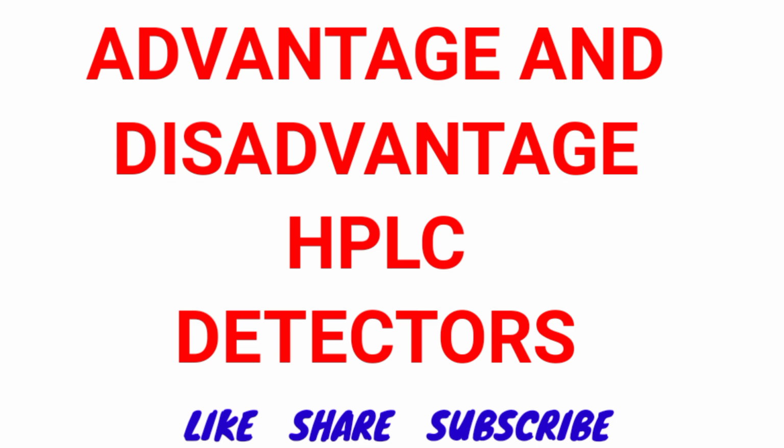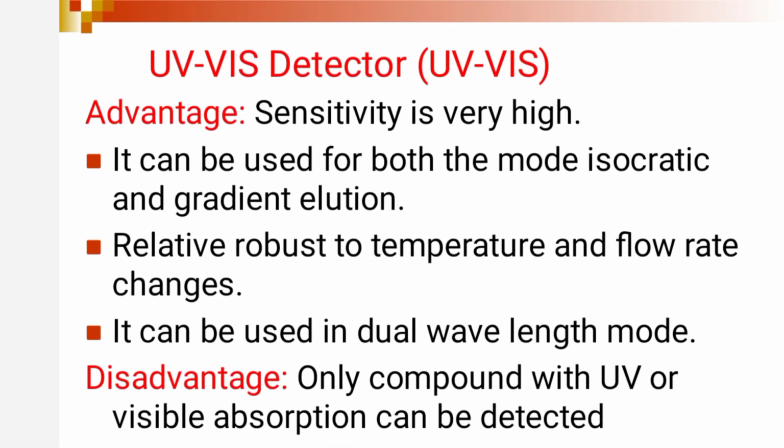Friends, in today's video, I am going to discuss the advantages and disadvantages of HPLC detectors. Number 1 is the UV visible detector. The advantages are sensitivity is very high.